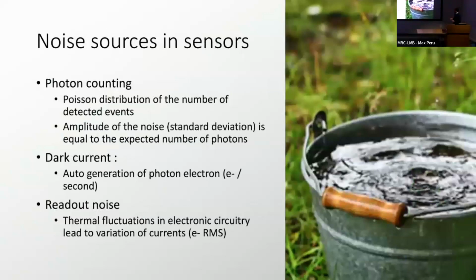There is a dark current on camera-based systems, which is the generation of photoelectrons, and which is very low due to cooling. And then another important noise is the readout noise, which is just noise created by reading and counting the electrons and converting them into digital units.